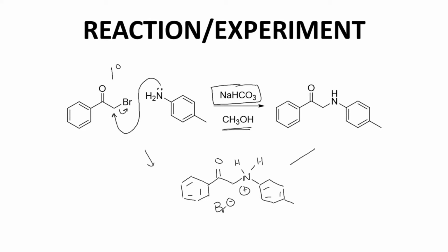And the weak base comes into play in our last step. Here is bicarbonate. And our weak base is going to help deprotonate this extra hydrogen on nitrogen, and that's going to give us our final compound. So this is our SN2 product.